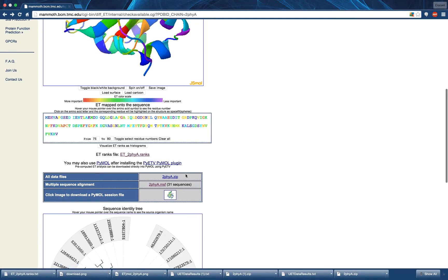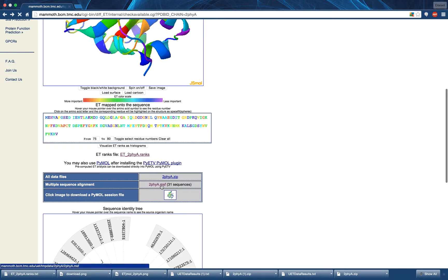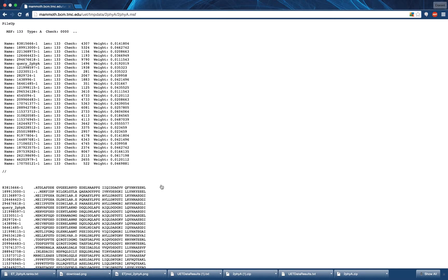In the table below, you will find three files. The first is the zip file which was downloaded earlier in the video. This is followed by the multiple sequence alignment file. This file can be downloaded by right-clicking and selecting Save As.